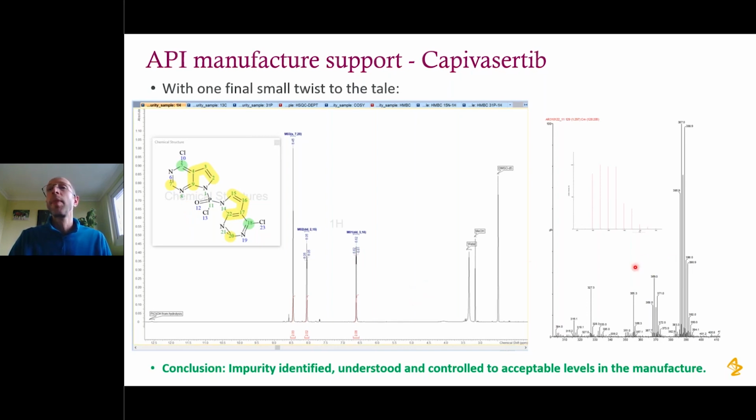Mass spec also went back and had another look at this using a new ionization technique where they sampled directly from solid rather than dissolving and subjecting the compound to hydrolysis. And again, here you can see the detected isotope pattern and also the predicted isotope pattern for the trichloro compound. Complicated slightly in this case because we have a mixture of M+ and [M+H]+ mass ions, but however, it holds true.